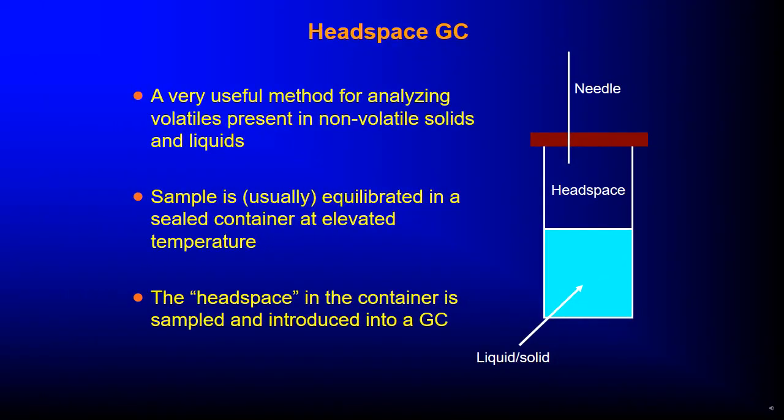Then we have headspace, a very useful method for analyzing volatiles present in non-volatile solids and liquids. The sample is usually equilibrated in a sealed container at elevated temperature. The headspace in the container is then sampled and introduced into the gas chromatograph.